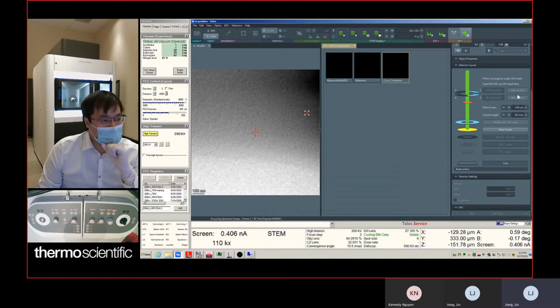Yeah, this is just random count, right? So in this case, we get a net signal. We just get about 1,000 counts to the detector of 2 and 3.